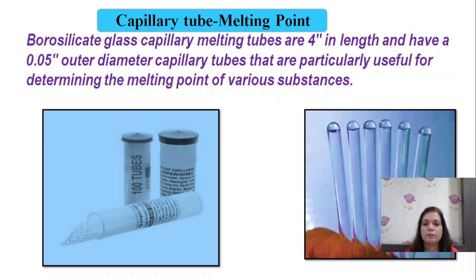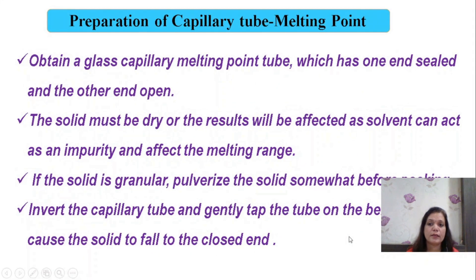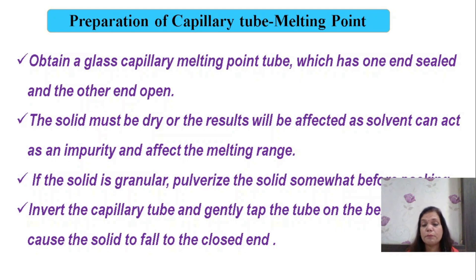These are the borosilicate capillary tubes which are being supplied in this packed form. This is the bottom sealed end. You have to check out the sealed end, and from the open end you need to fill the substance inside the capillary. While filling the substance inside the capillary, you need to take the precaution that the substance must be dry. If it is wet, the temperature required may be more than expected, which may lead to an impure compound conclusion.